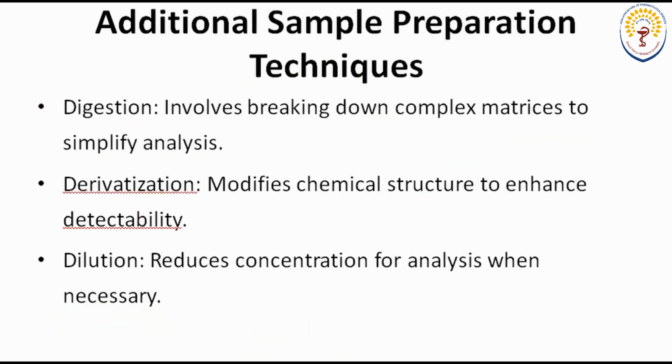Now there are also some additional processes for sample preparation. The previous processes were the most common processes that we use in our day-to-day analysis, and they are used in all kinds of analysis. But there are some special processes that are also very important to know. The first process is digestion.